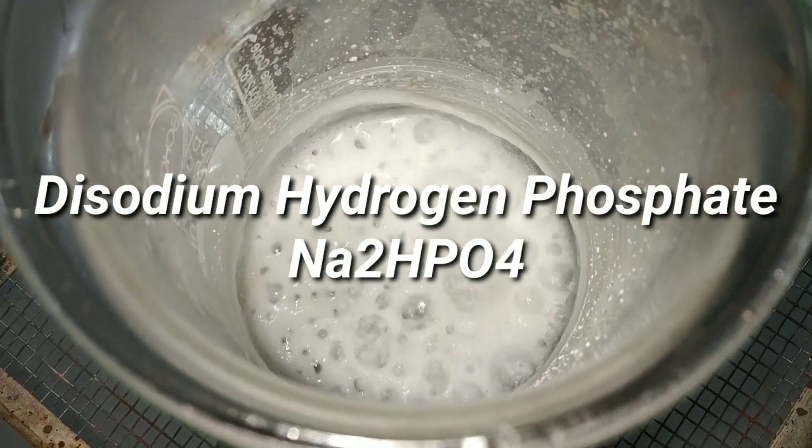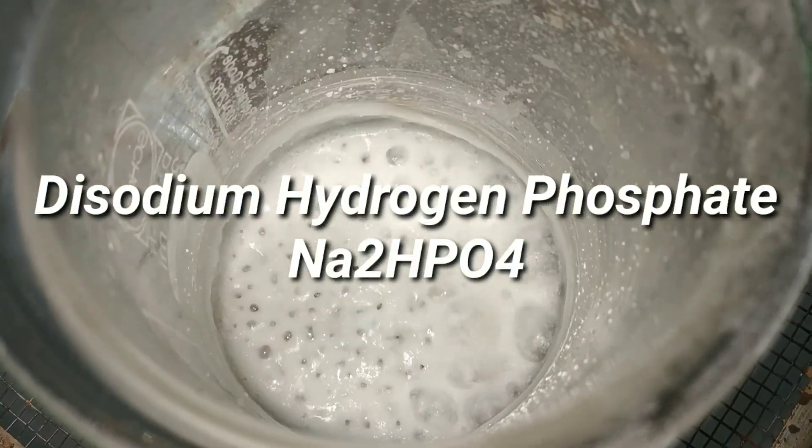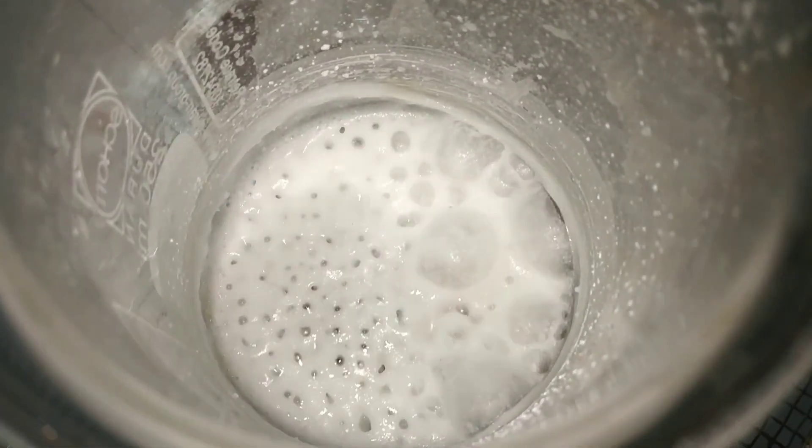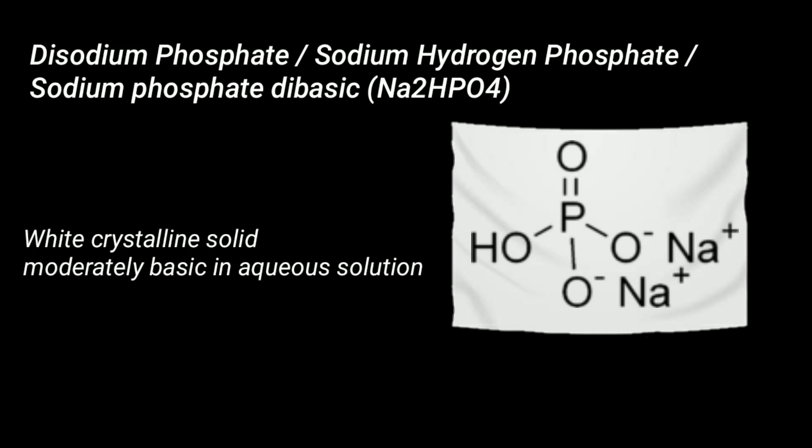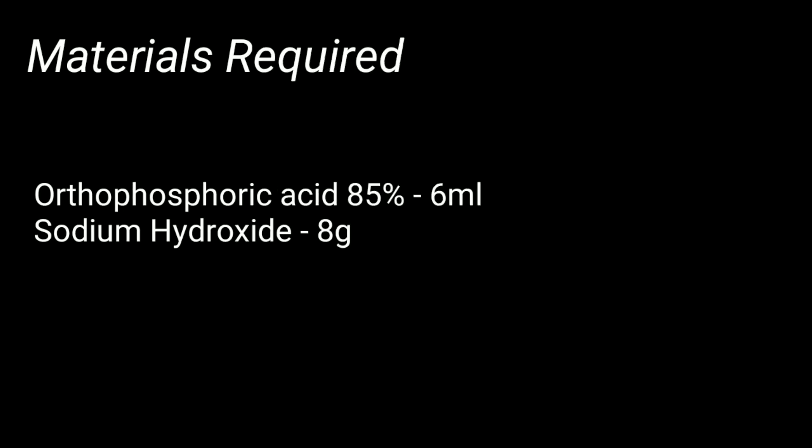Friends, in this video we will make disodium hydrogen phosphate and see some of its chemical reactions. Disodium hydrogen phosphate, known by a variety of names, has the chemical formula Na2HPO4. The preparation is just a neutralization reaction between orthophosphoric acid and sodium hydroxide.